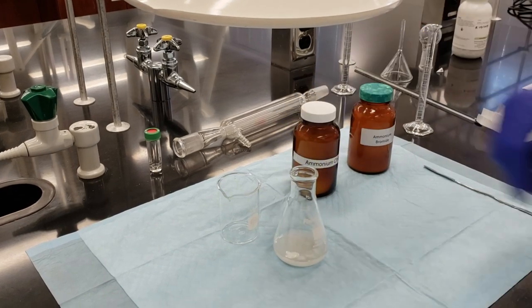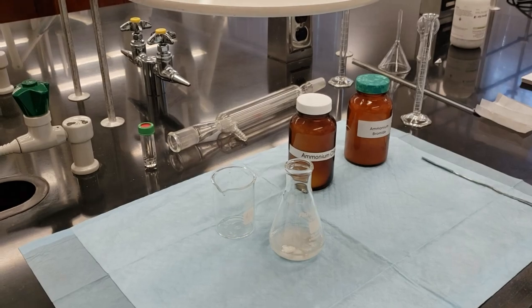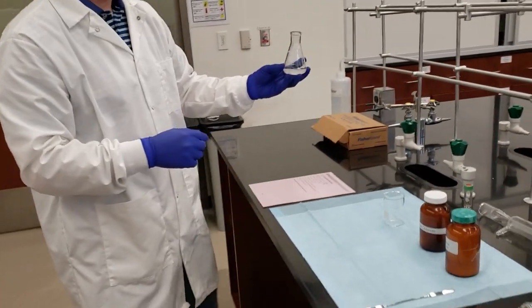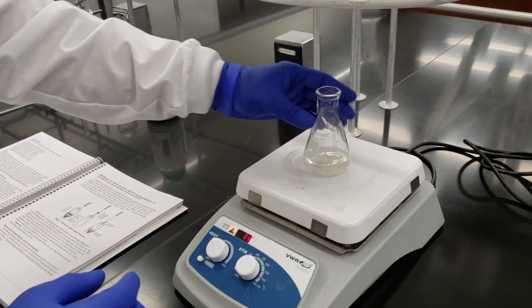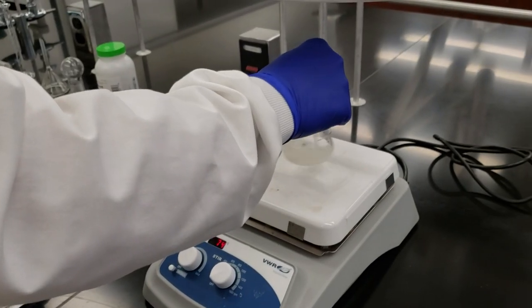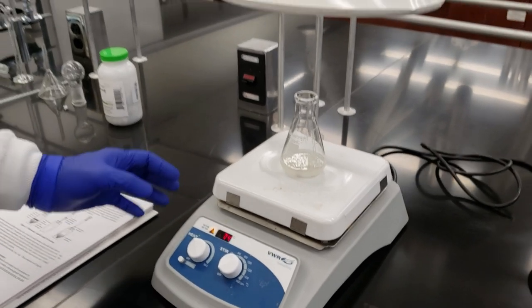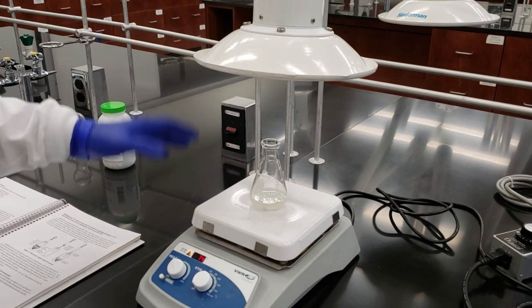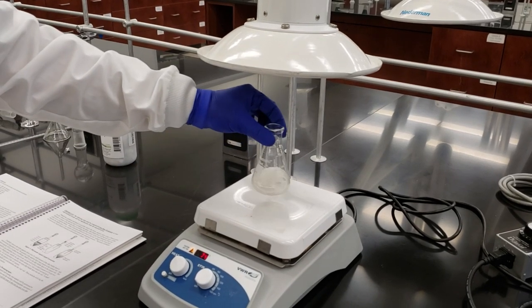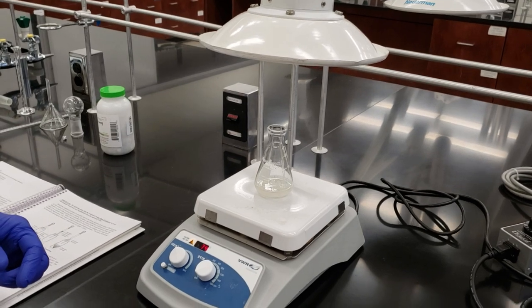We're going to take it over to the hot plate and start heating it so it'll dissolve. All right, so we've transferred our reaction mixture over to our hot plate. We've set it to around 74, 75 degrees Celsius. We've got our snorkel in place. We're going to heat this gently for a little while until all of our solid goes into solution, then we'll move on to the next step.